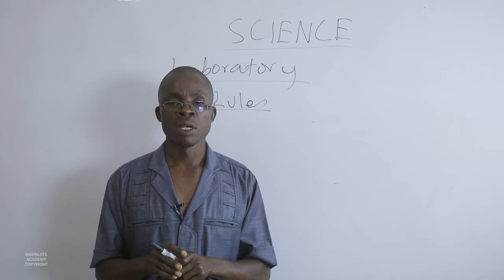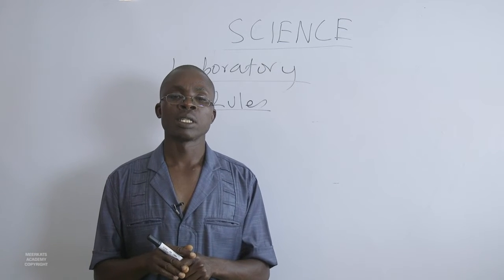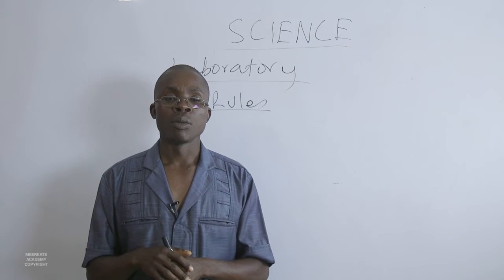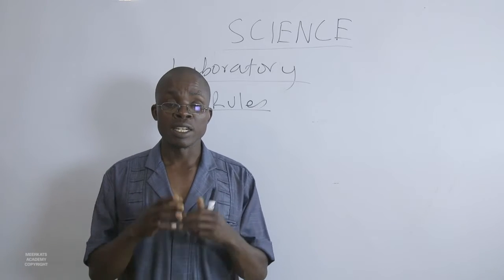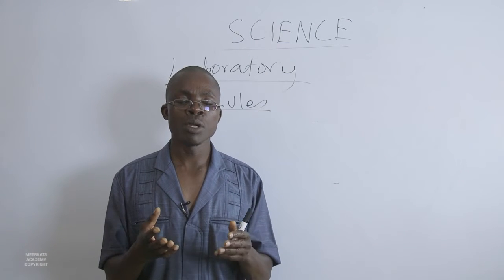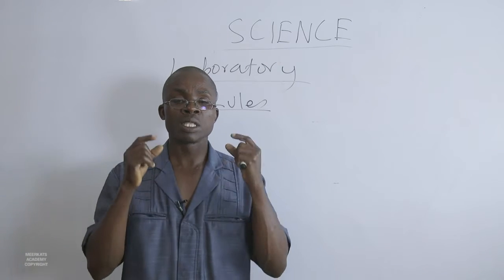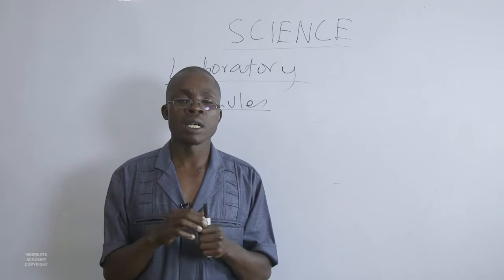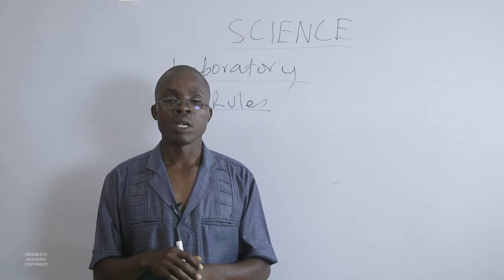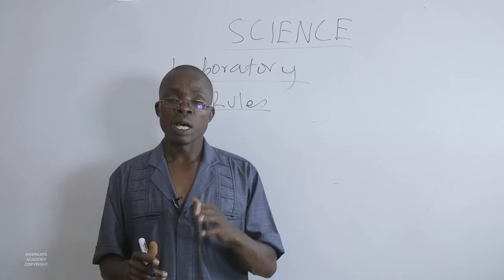Never perform an experiment with the naked eyes. Always have the glasses. We have the lab glasses that you have to put on, not like these ones of mine. But if they are not there, at least for me, I may be a little bit safe because partially my eye is covered. But for you, maybe who is not having glasses, it is always good to cover your eyes. However, even me with these glasses, these ones are not enough. I need another cover which is wider. They are usually wider, so they will cover your eyes in a much better way for your safety when doing experiments. That is to do with the rules.